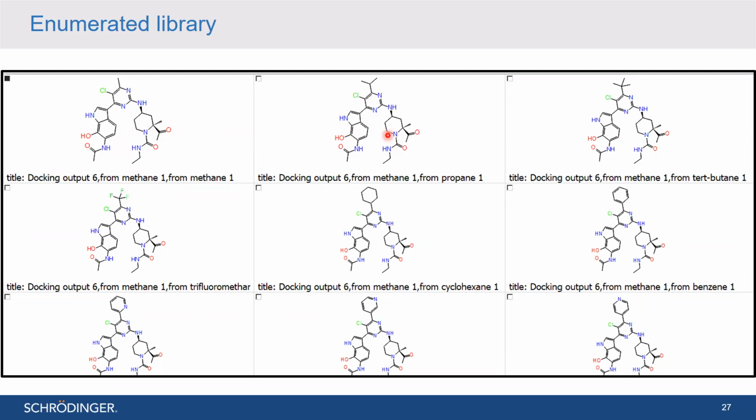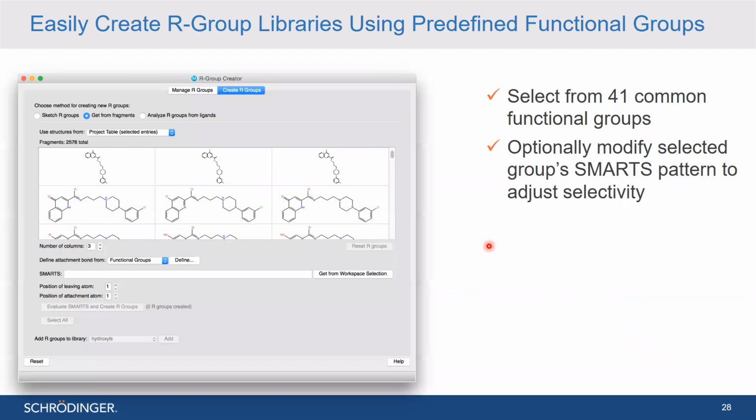So you can see all those 2D structures which are present in the library. Their names are also given according to the substitutions made on this R1 and R2 group. So you can see all those structures in 2D representation. But one of the very interesting things is somebody may ask, those R group libraries are inbuilt, present in the software, but can I create my own R group library? Because an R group library can be of my interest, whether I could create it or not.